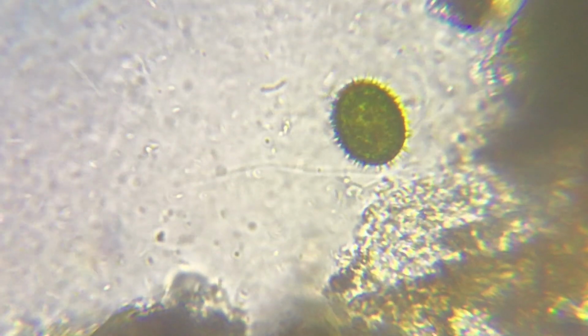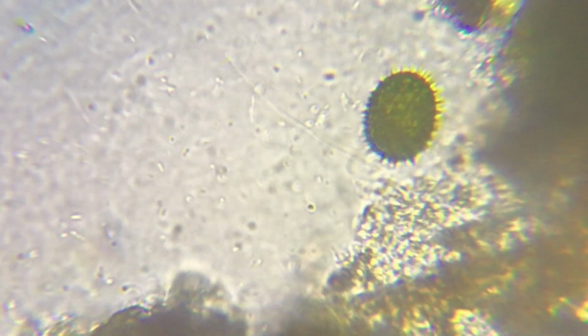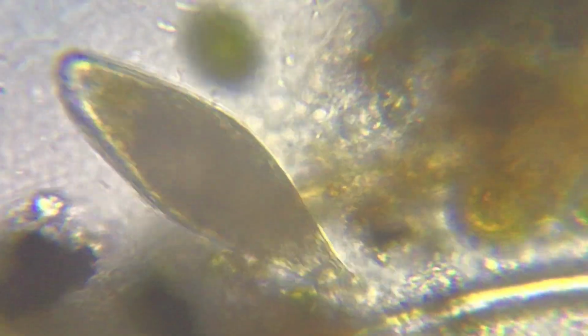Oh, look at this. There's another green blob flying past our little heliozoa buddy. Looks like it might be getting attacked. Maybe it's just trying to stab stuff so that there's less stuff always zooming by it because it's so slow.